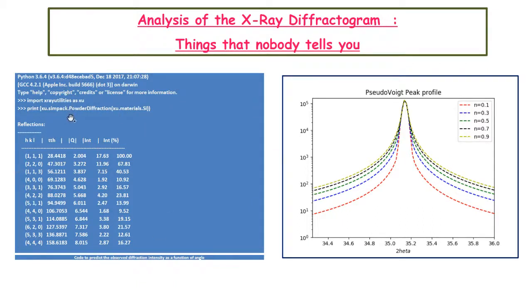It's just two lines of code in Python, and you give your material, it can be a composite material, and it tells you what the HKL indices are, what the angles are at which you should get the line, and what the index is. So you can know beforehand, this is what I expect, because we always believe that if you know what to expect, then definitely you can look for it intelligently. Any measurement should not be a picture given to me by my colleague, and then I just go and put it in my thesis or in my paper and that's the end of the story.